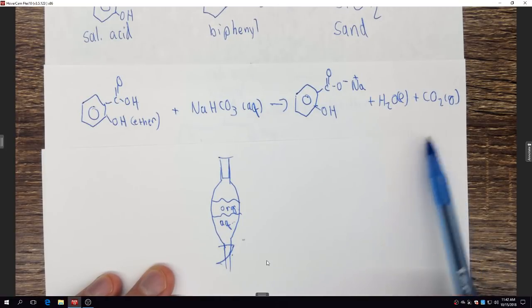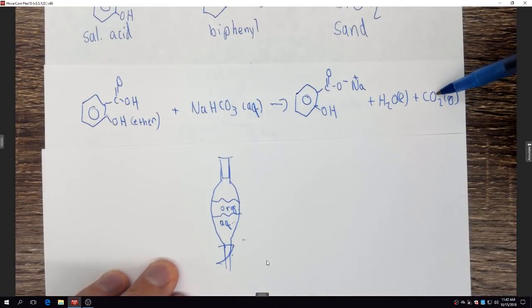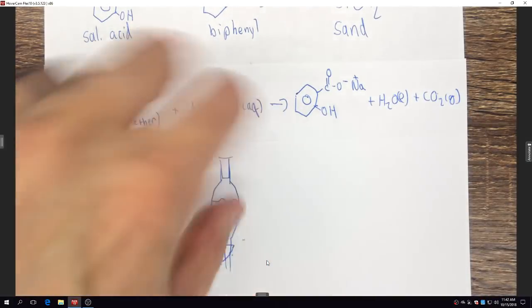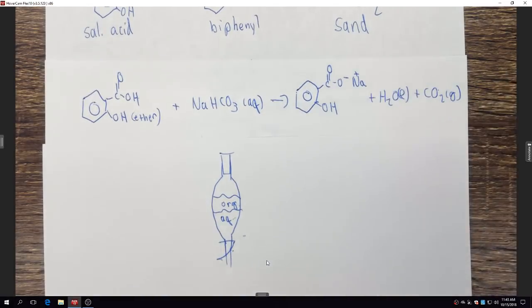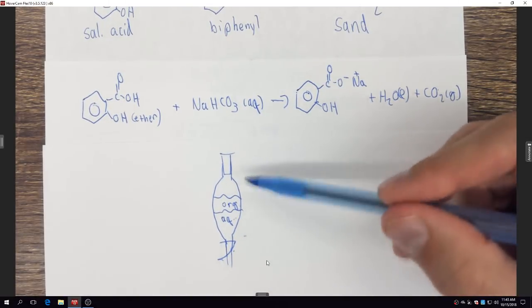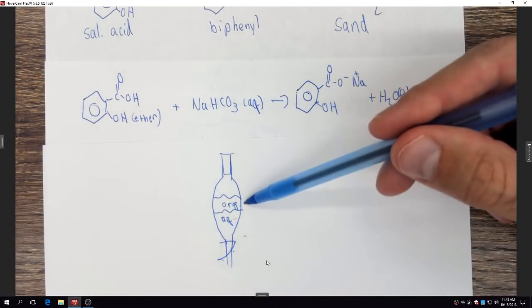So what do you do in order to safely generate carbon dioxide gas? You basically take this entire thing and flip it upside down so that this is sticking up, and you open the stopcock and it'll go shh, and then you close it, and then you just gently move it around, and then you flip it upside down, shh, until you stop getting that carbon dioxide venting. And then you can shake it more vigorously, progressively, so that you only have a small amount of CO2.